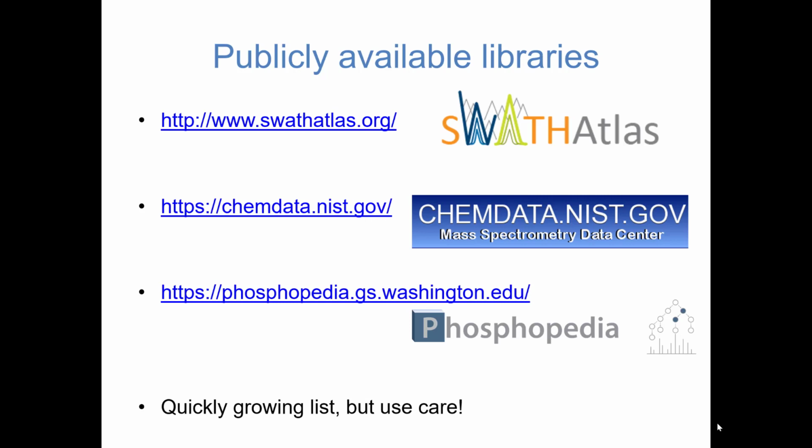So you really think that if I have a library on QExactive, and then I'm switching to Orbitrap, I'm doing a mix of them, and I'm converting the DIA on Orbitrap is not good? I think mixing between HCD and CID is not good. I've done this analysis. No, but both of them in HCD. Both the Orbitrap and the QExactive in HCD. That's fine. So same fragmentation pattern, fine.